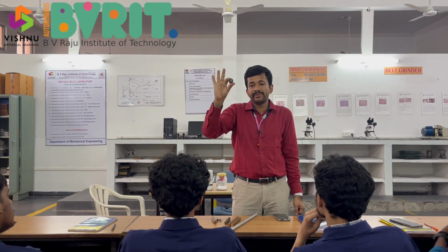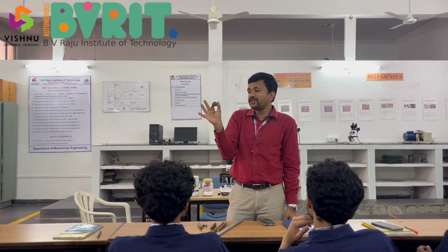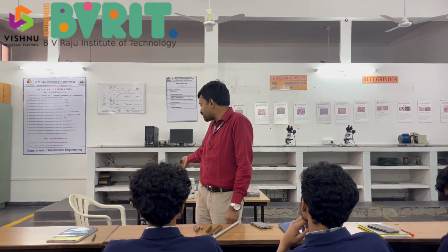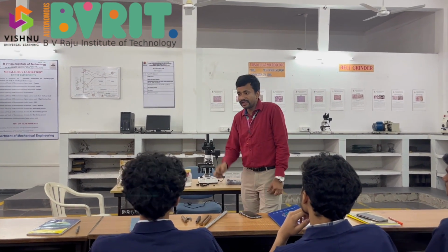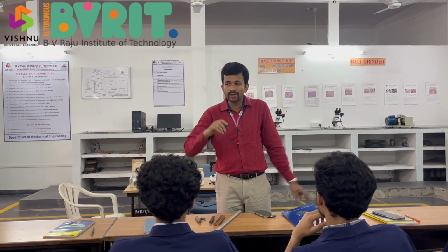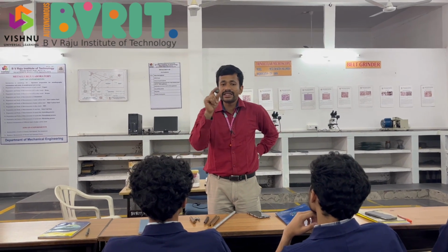and it will transform into this specimen. Okay, so this is the specimen which is comfortable for us to hold, polish, use under the microscope, and also use for other purposes like etching and other things. So that is how we do it. Okay, any doubts in the specimen preparation? Understood the specimen preparation? We are going to demonstrate that also next. Okay, so this is how we prepare the specimen.